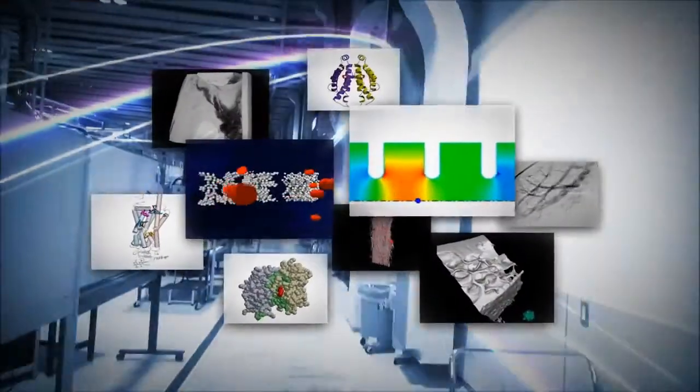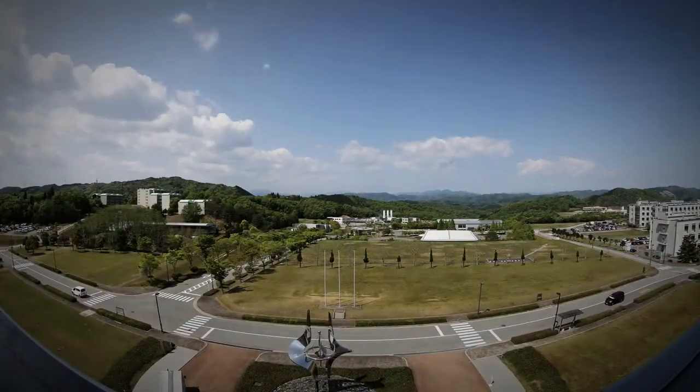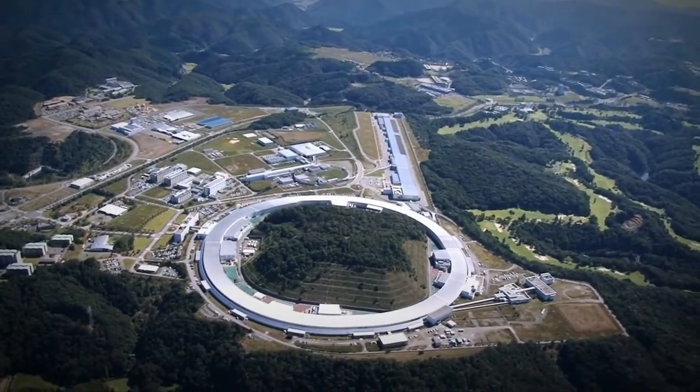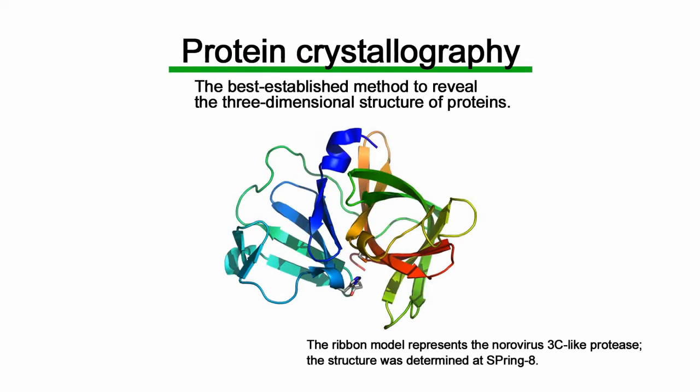Since 1997, SPring-8, a large synchrotron radiation facility, has been utilized in various fields such as structural analysis, functional analysis, and imaging. The three-dimensional structure of proteins can be determined at SPring-8 by using the protein crystallography technique, which is the best established method for the structural study of proteins.